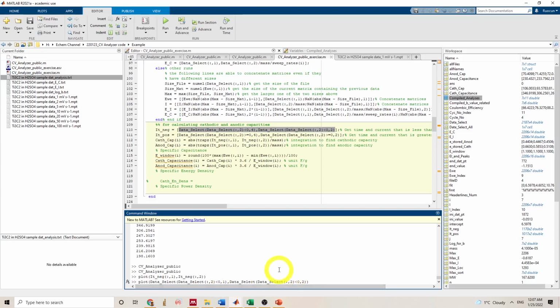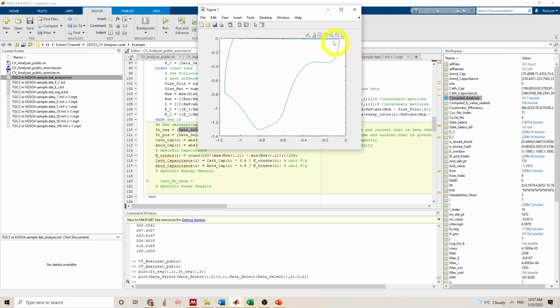So that's the first column. Let's see how it goes. So here we go. I think this is the point we want for the final voltage, and this is the beginning voltage, because somewhere here is the open circuit voltage. In current as a function of time, it got broken up, but in the potential profile, it looked okay.